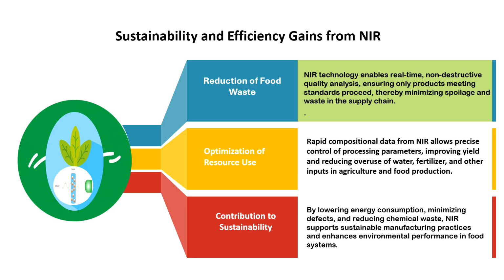Reduction of food waste. NIR technology enables real-time, non-destructive quality analysis, ensuring only products meeting standards proceed, thereby minimizing spoilage and waste in the supply chain. Optimization of resources.